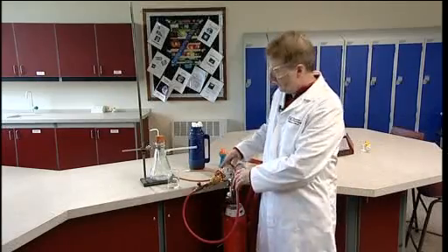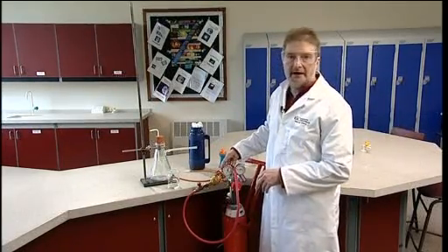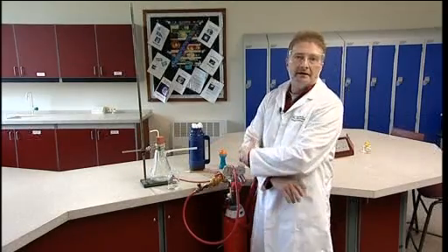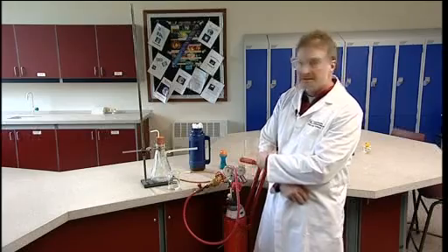This is a fun experiment which involves blowing bubbles of carbon dioxide, which sink due to the high density of carbon dioxide, and bubbles of hydrogen, which float because of the low density of hydrogen.